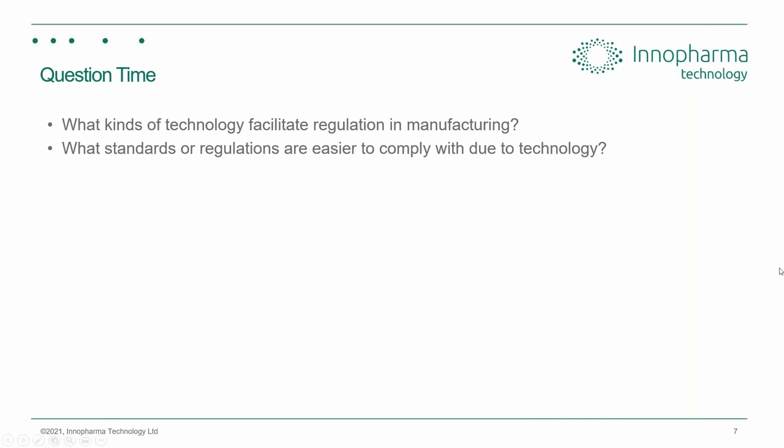Yeah, certainly. And in fact, our particle size analyzer uses automated image analysis. So related, deep learning, yes. So certainly artificial intelligence, machine learning, deep learning, yep, all of these things. And so I want you to think about today, paperless records, APIs, sensors, yes, data integrity, absolutely. Yeah, so audit trails, yes. So here we go. These are exactly the right points. And these are, in fact, the arguments that the regulators are putting forward. It doesn't just mean that they have greater insight into our business. It means that we have greater insights into our own processes.